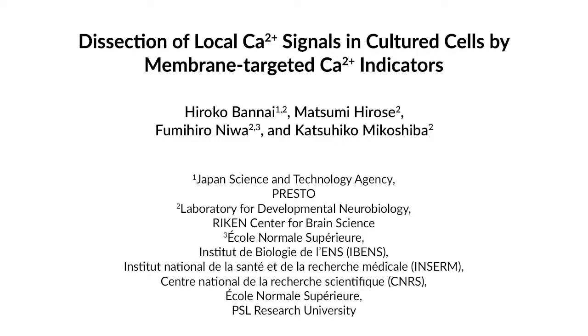The dissection of the calcium signals at a subcellular resolution is one of the most important steps for decoding intracellular calcium signals that determine the output biological phenomenon. This protocol describes a new calcium imaging method that enables the monitoring of the very moment of the calcium influx and calcium release. This protocol is applicable to all cell types that allows the expression of genetically encoded calcium indicators.